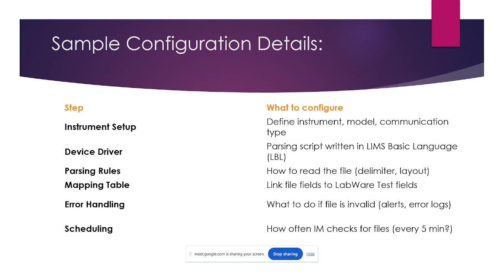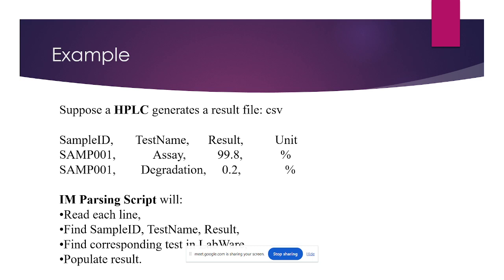Okay, this is what I am telling about the web-based one. SaaS-based, the cloud-based LIMS application, is different. This is the web application, web-based, I am telling. In the web-based case you have to create the scheduler server. If it is application-based, then you can create the schedule in the application itself. That is one more option. Some of the schedules we need to create with the server only, so those schedules we need to create in the scheduler servers.